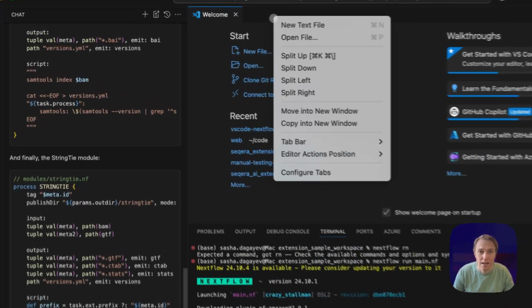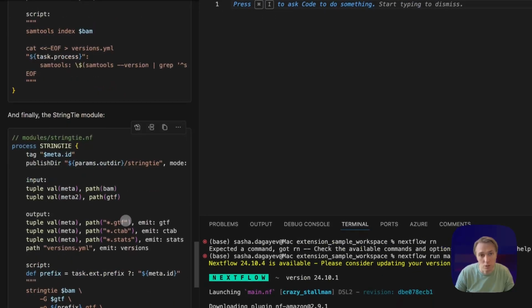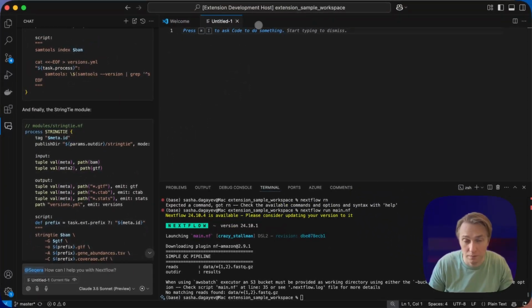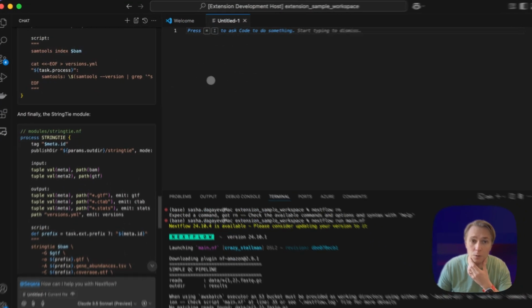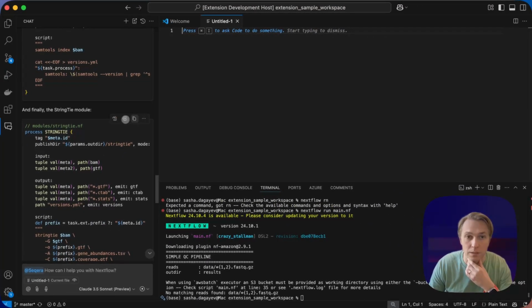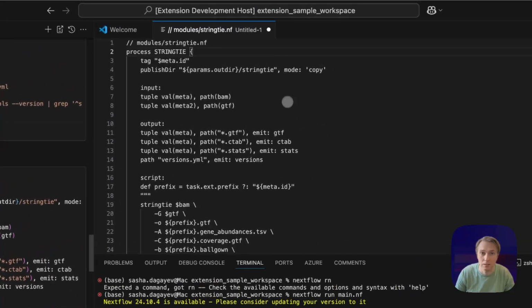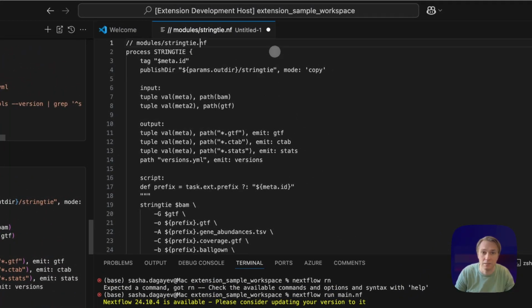So in this case, the extension does a really nice job of doing exactly what we want it to do. Now, if you want to actually use some of these code blocks, all you have to do is either create a file or, in the file that you want, put in your cursor, and then simply insert the information here.